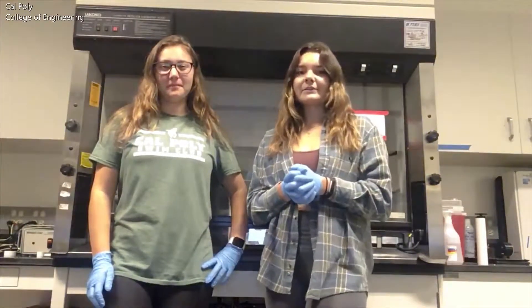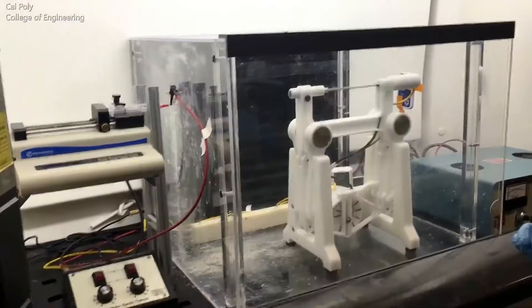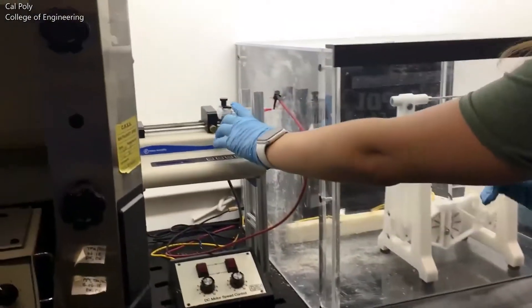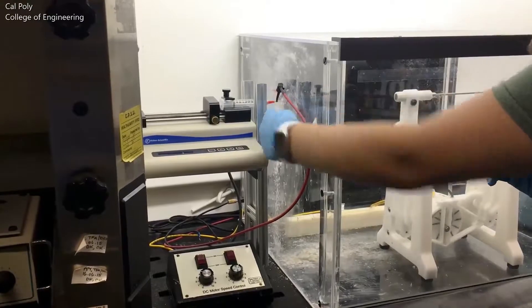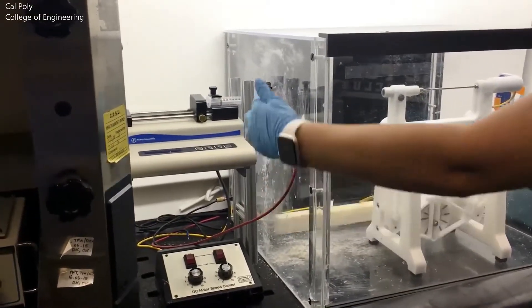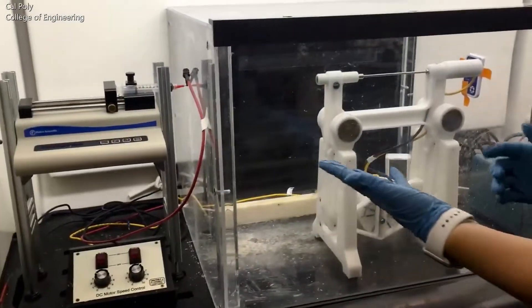Evan is now going to show you how we make these fancy straws, which we call scaffolds. To make our scaffolds we use a process called electrospinning. Here we take our polymer solution into a syringe and connect it to a metal needle tip. Then we use the voltmeter to run a negative charge through the needle, charging the polymer within. Then we allow the polymer to be slowly released towards the collector.